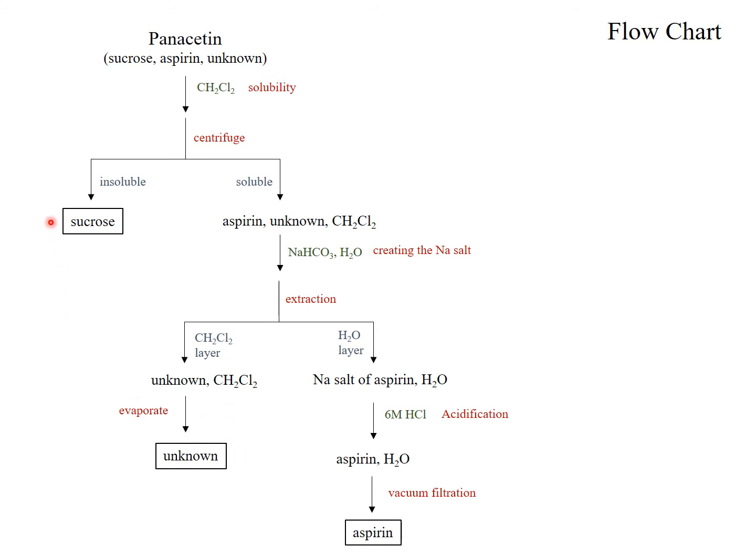Now I have my sucrose, my unknown, and my aspirin all separated. They're all solids now. I can weigh all those and determine the percent composition of my panacetin.